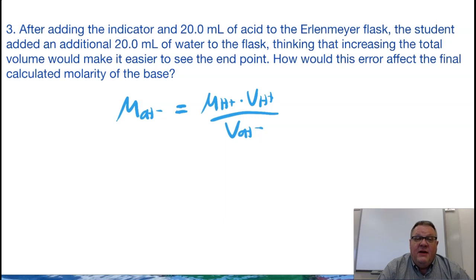Okay, this is actually not an error because we haven't changed the molarity, any number of moles of H plus, and we haven't changed any moles of OH minus. And therefore, just adding water is going to give you, like I mentioned in the demo, a little bit more liquid to see, but it doesn't increase or decrease moles of H plus added, and it doesn't increase or decrease moles of OH minus added. This is not an error.